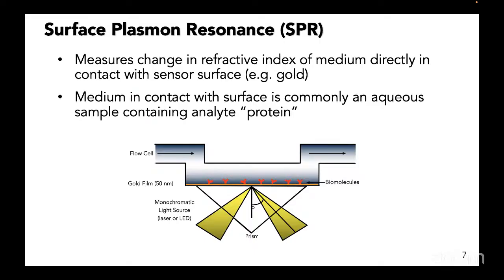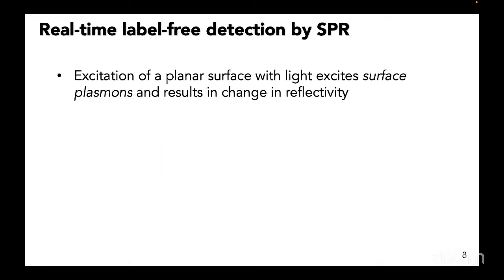While you have probably already studied this in my lectures, just refreshing you, one of the key technologies in the label-free biosensor, which has been the gold standard in the field, is known as SPR, surface plasmon resonance. Here the molecules are immobilized on a gold slide, with a light source and a prism. You are looking at the refractive index of the medium changing in response to the binding of the molecule.